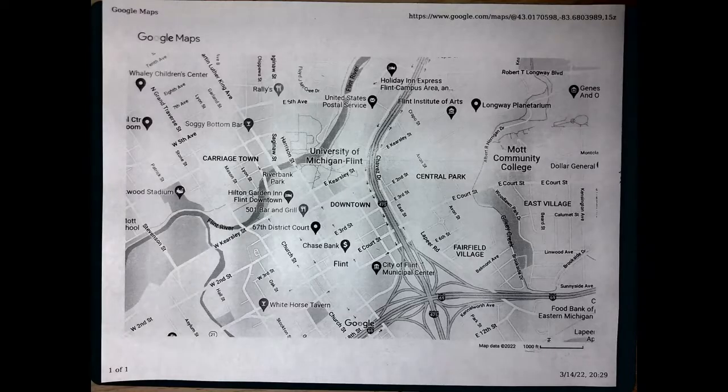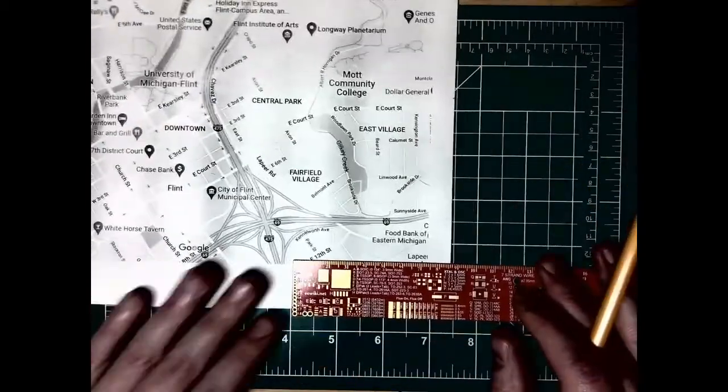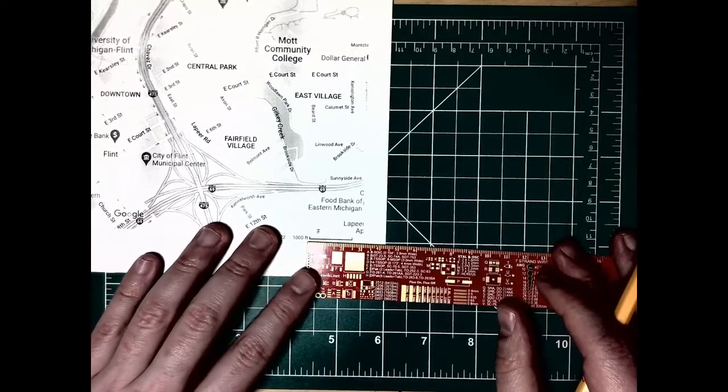In this video, I want to show you guys a technique for being a little bit more quantitative with our results in this week's experiment. I think the best way to think about this is to start off by thinking about a map. In this map, I have down here what they call a map scale. This is a distance that corresponds in this case to 1,000 feet. What the map scale allows me to do is, regardless of how large or small I print off the map, I can come down here with my ruler and measure this distance.